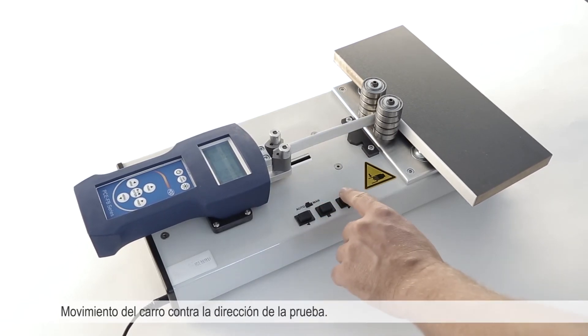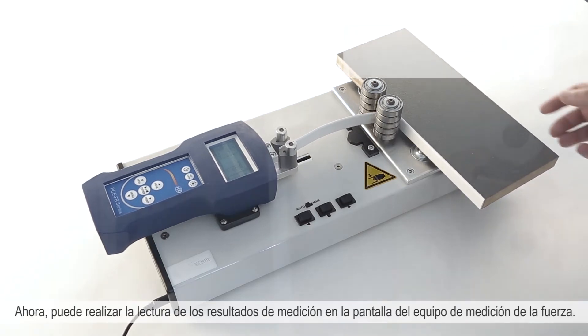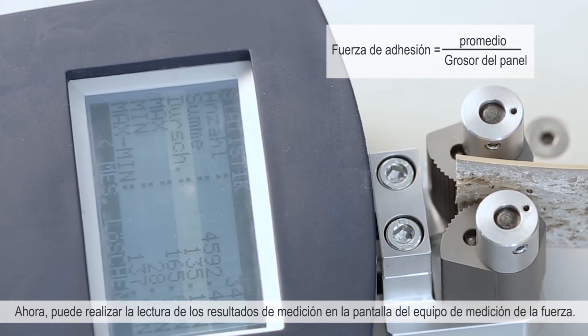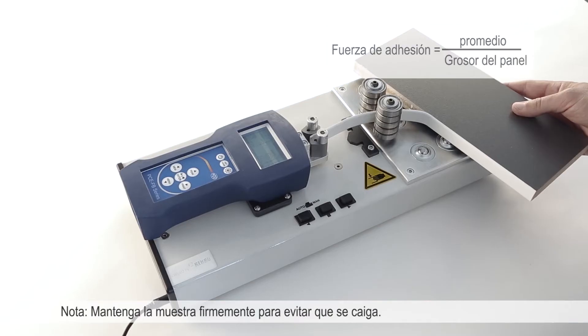Stop the carriage in automatic mode, then move the carriage against the test direction. Now you can read the results of the measurement on the display of the force measurement equipment.